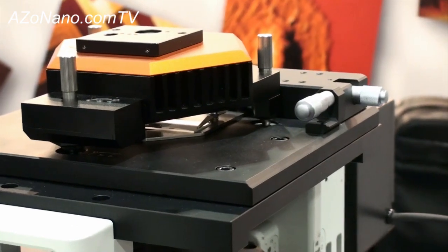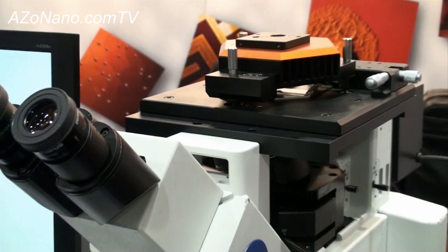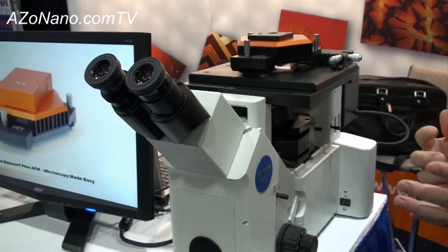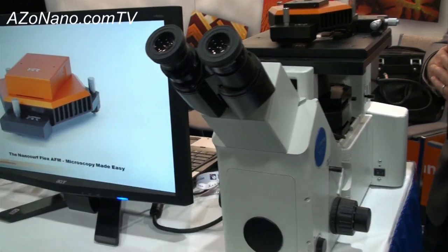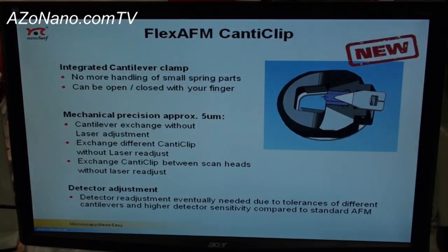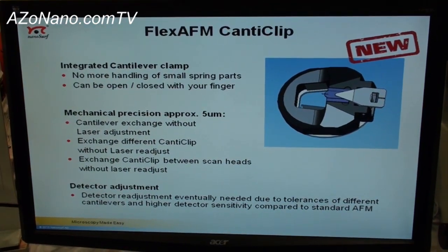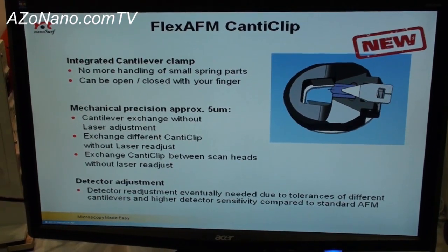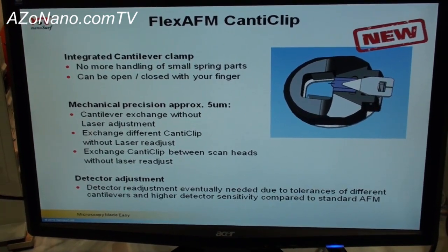We also have a variety of other new options for the Flex, trying to build upon the available options for the system that the research community might be interested in. To enable ease of use for cantilever exchange, the Flex has a new spring clip cantilever change mount that allows for easy exchange of cantilevers by a thumb clip mechanism, and this will be an enhancement for ease of use for our researchers.